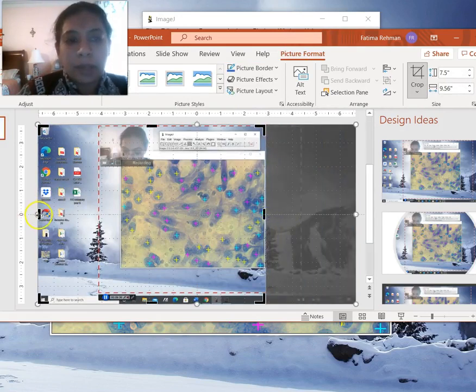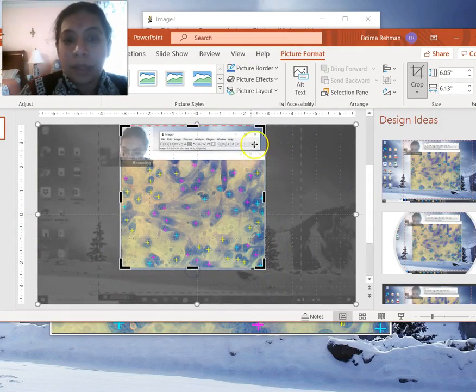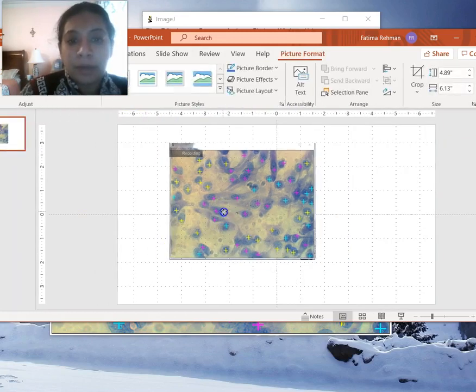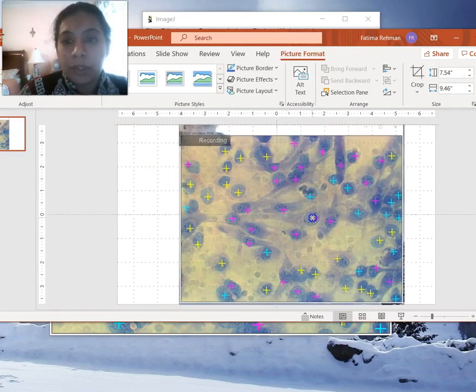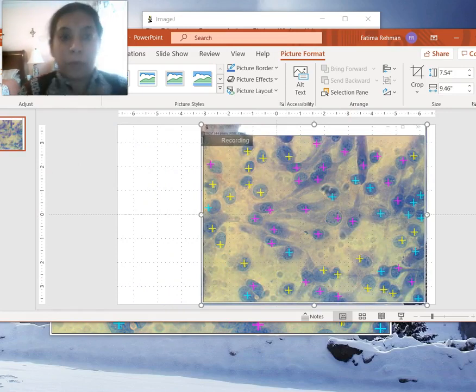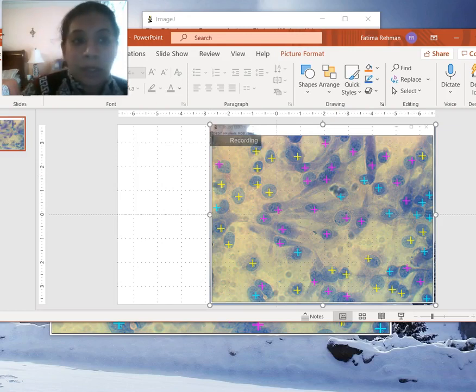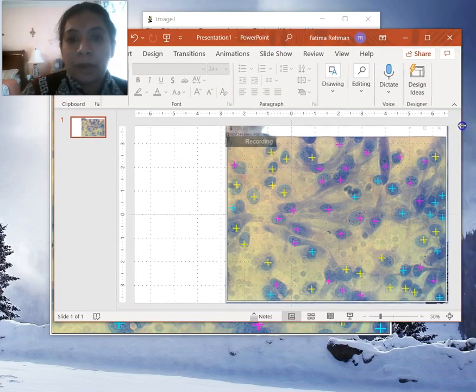Sometimes it's easier to do that simply because the images taken through print screen are less bulky. Imager usually gives a really bulky file otherwise, and it can cause storage issues for some people on their devices, but a print screen image is usually less bulky. It's not as high resolution, but it provides all the information that you need. Especially for my students in research, I ask them to make a slide for each one of their images when they're doing this, and then insert a text box with all the counts on the side so that they have that information handy and available right there for them.